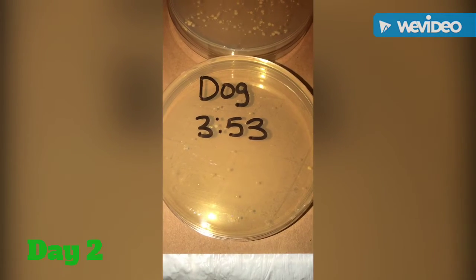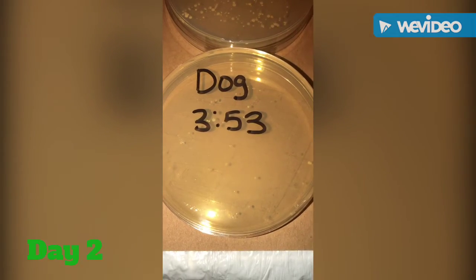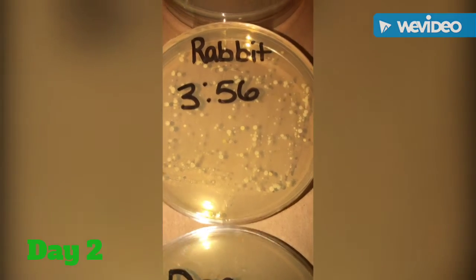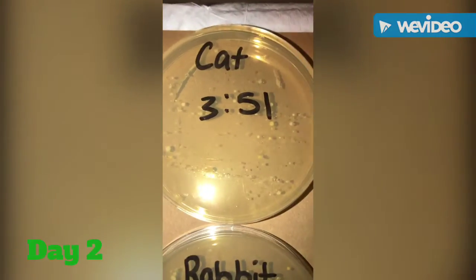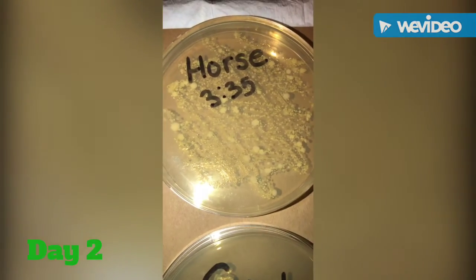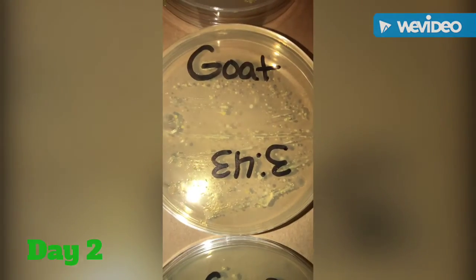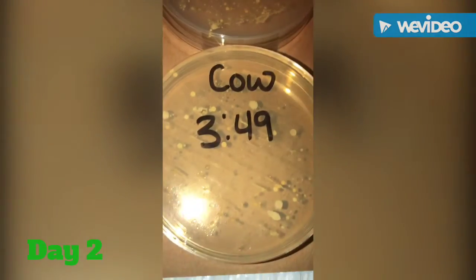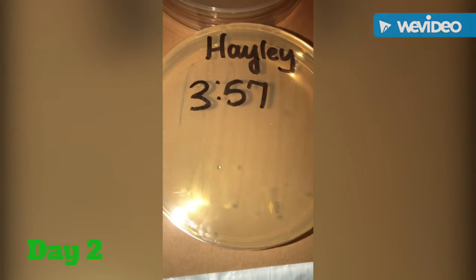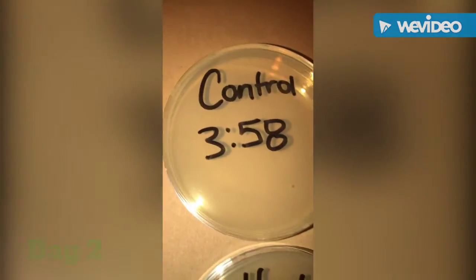August 9th, 2020, 2 days after I swabbed the animals. There's the rabbit, the cat, the horse. Remember, 2 days after I swabbed the animal. Goat, cow, myself, and then my control. So the control has nothing in it.